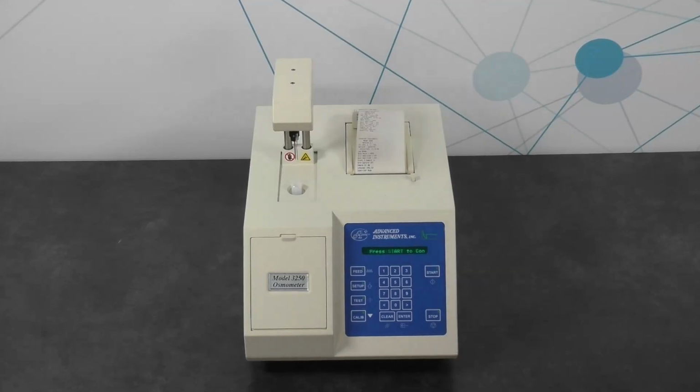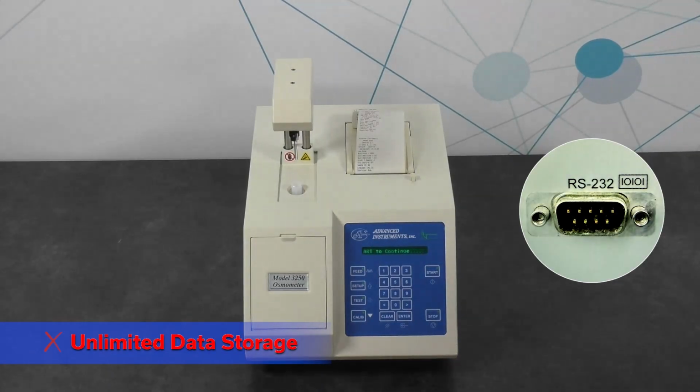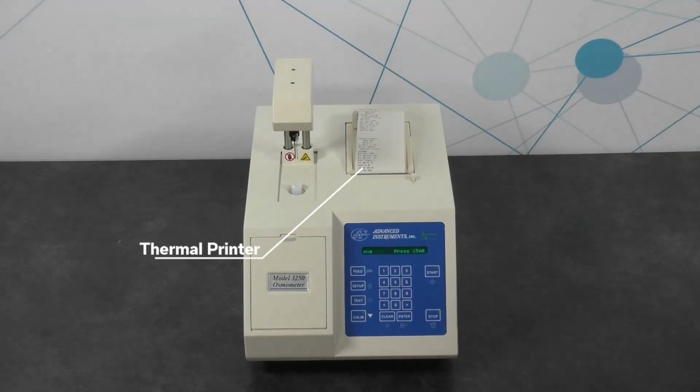Since we're talking about GLP and GMP environments, we need to take a look at how you manage your data with the Model 3250. So the Model 3250 will store 30 test results, and you can export that data out through an RS-232 communications port. However, that is really inefficient to export 30 results at a time. It also has a built-in thermal printer, which is suitable for the clinical environment, but is not suitable for the biotech environment. As you know, it fades over time, and therefore you would either have to transcribe the results into another database or make a copy of the printout.